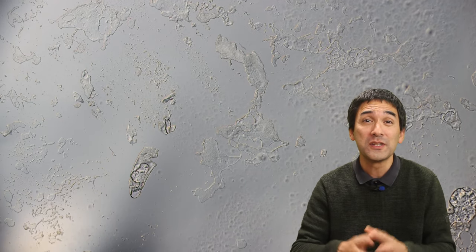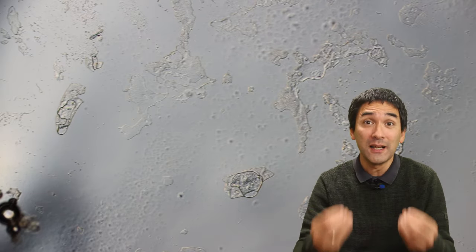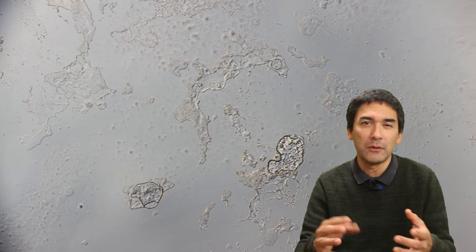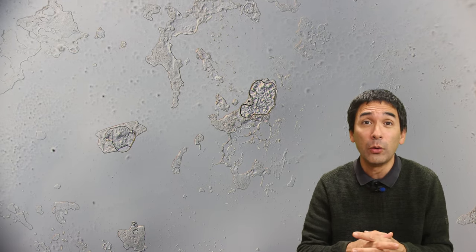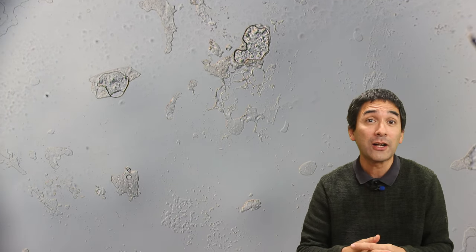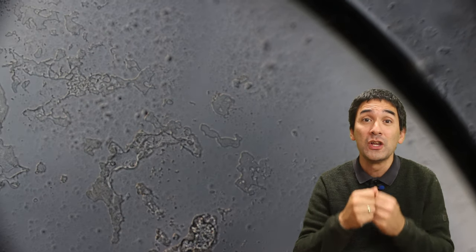Under the microscope I was able to discover something relatively interesting. First we have to put a cover glass on top. You have to look a little bit carefully but you're going to see a lot of grime and dirt and also some cells, a few air bubbles. All of the grime here that you can see on the old contact lenses is actually a place where bacteria can grow and multiply. Maybe there are also some salt deposits - after all, tears are quite salty. The round line that you see here is not an edge of the contact lens.